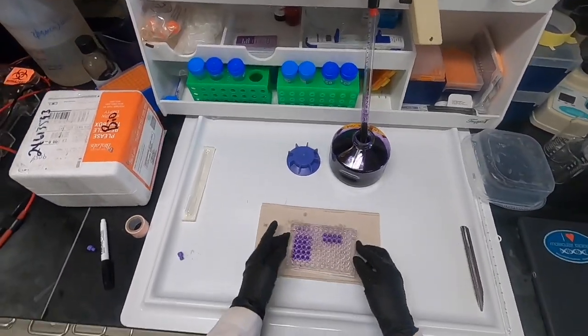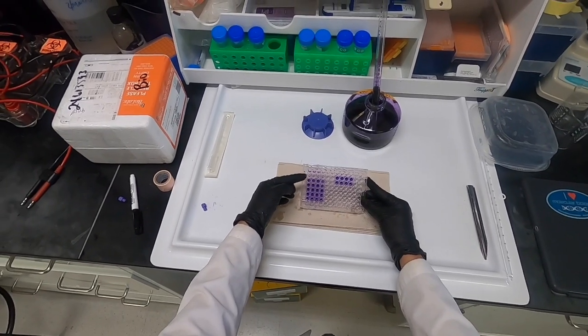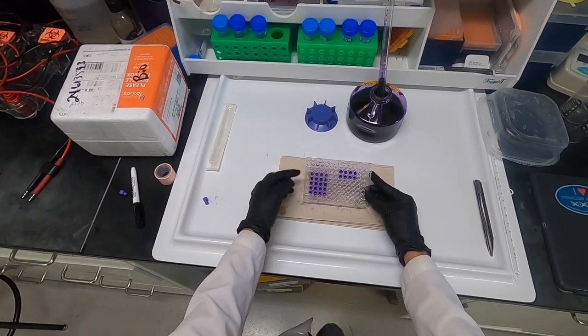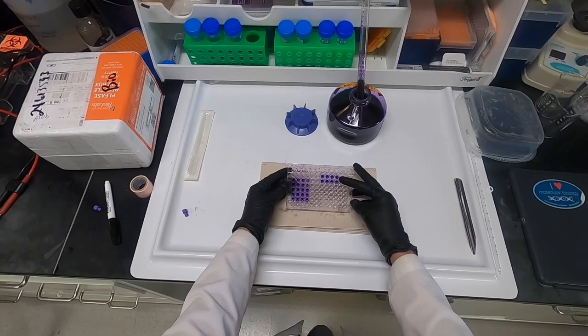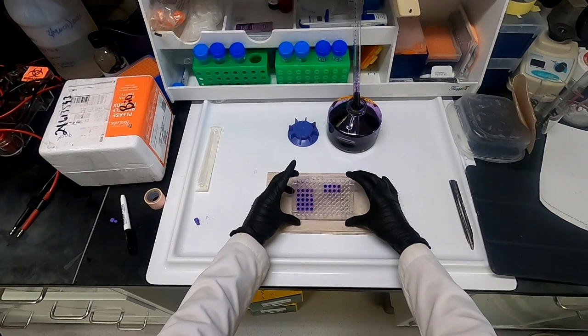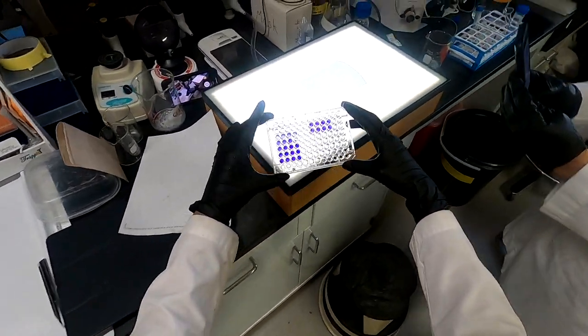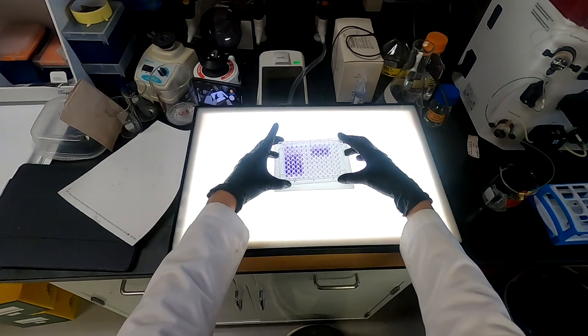If you remember from our diagram, you will see that there should be a gradient of cell death that is highest from the top and lowest at the bottom. You can also see that our positive control exhibits high toxicity while our negative and vehicle controls exhibit low toxicity or no toxicity at all.